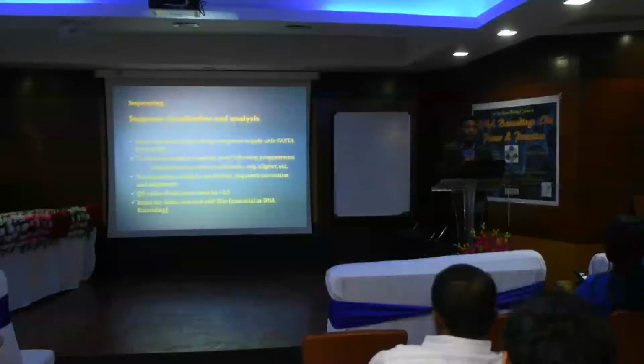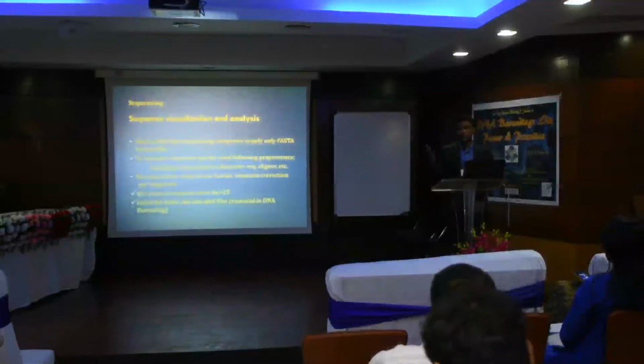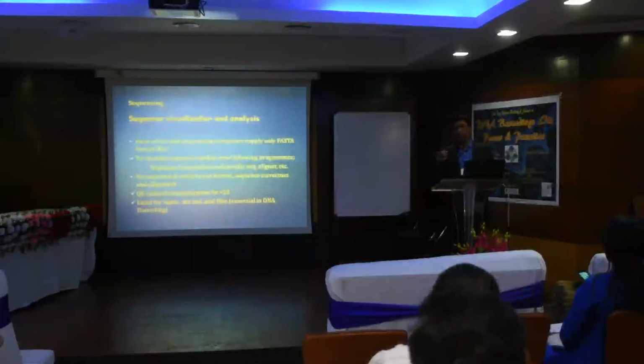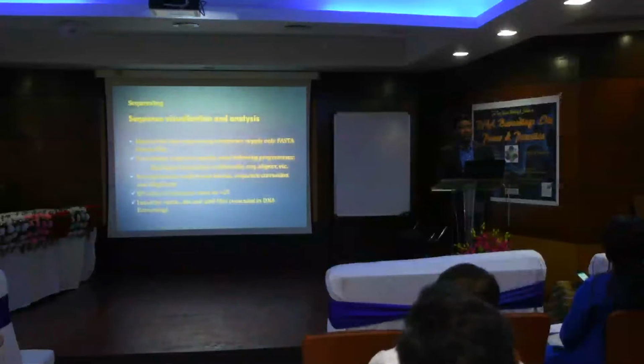The QC value of private companies should never be 30. Never be 30. They want to make 3 reactions out of one reaction, otherwise they will never survive. So you send 10 samples, you will get sequences for 3. It happens very commonly. Sometimes one side will be good, another side very bad, and finally it reflects on your data, and such bad data will never give you a good publication.